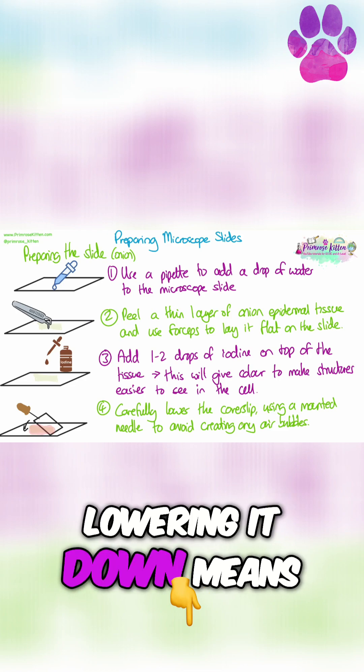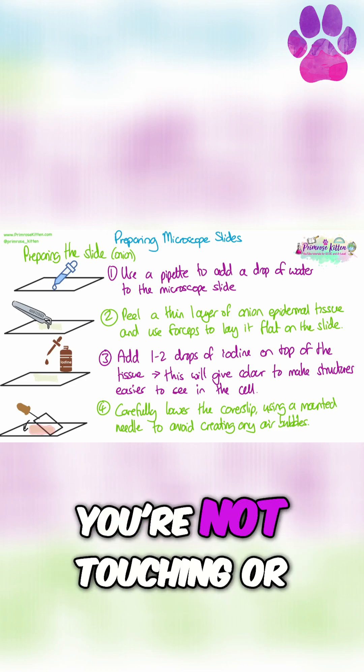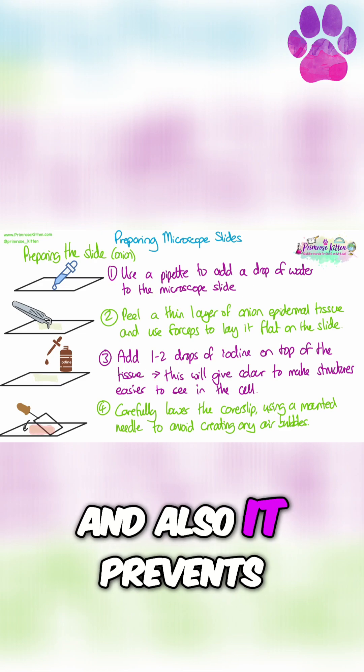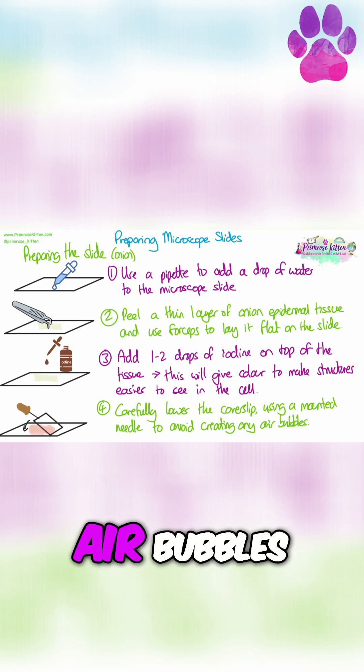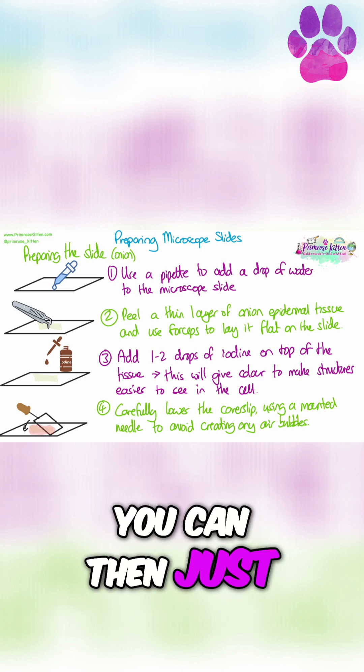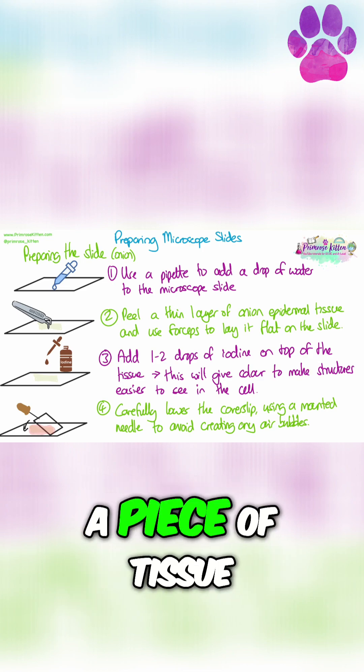And this way of lowering it down means that you're being gentle, you're not touching or putting fingerprints all over the coverslip, and also it prevents us from creating any air bubbles. If you get any liquid coming out from outside of the coverslip, you can then just blot it away using a piece of tissue.